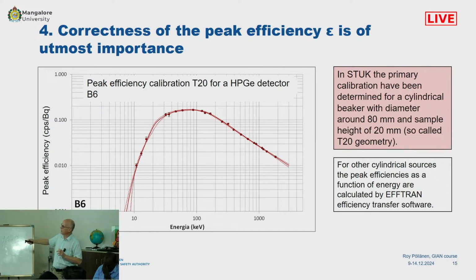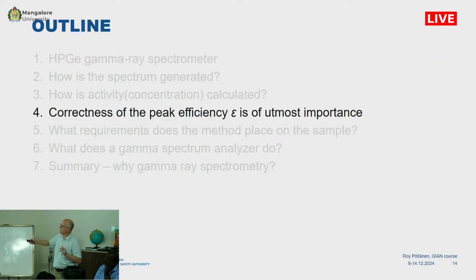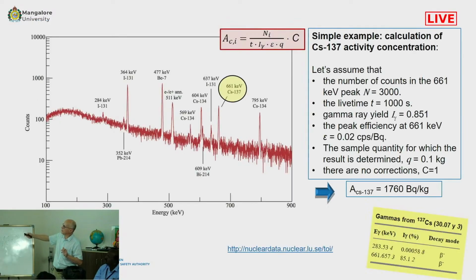However, we can fit a curve here. 186 is close here. So in determining the activity, we use that curve, not those points. So efficiency is strongly dependent on the energy. Is this the question that you wanted to know?